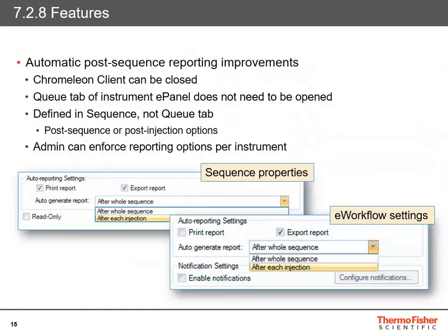Finally, there are several improvements to post-sequence reporting options. Before Chromeleon 7.2.8, to automatically generate a report at the end of an injection or sequence, the user had to set up options in the instrument queue tab and leave the Chromeleon client open until all reports were printed or produced. This release introduces significant improvements: you no longer need to go to the instrument queue to set up reporting, and reporting is performed even with the Chromeleon client closed. Post-injection and post-sequence report options are now defined in the sequence, meaning they can be predefined in an e-workflow, selected before acquisition starts, or edited while the sequence is running. System administrators can also enforce reporting options in the instrument configuration application, on the queue settings tab of the instrument properties, and these options will be applied to all sequences acquired on that instrument.